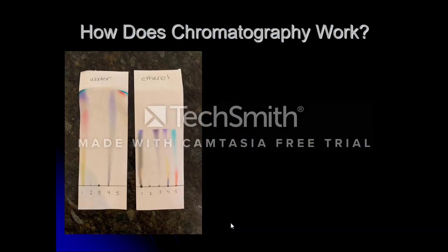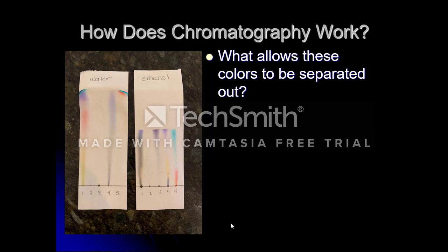All right, so let's talk about how chromatography works. So we need to figure out what allows the colors to be separated out, because you can see that black ink is not just black ink.